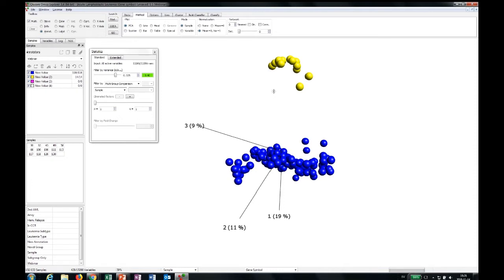We still don't know what the biological meaning of these groups is. We are just inspecting the data using tools to find subgroups and structure. As you saw from how I used the pointer here, you really achieve this and create the annotation and the coloring and selections with just a mouse, and it's really convenient.